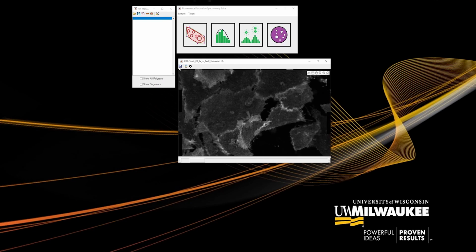To save the image stack, click the Save button. We can also adjust the contrast by clicking the Contrast Control button. And finally, a snapshot of the image can be saved as a .png file using the Snapshot button. For now, we're interested in drawing ROIs. To do that, navigate back to the ROI Manager window and select the Polygon tool.